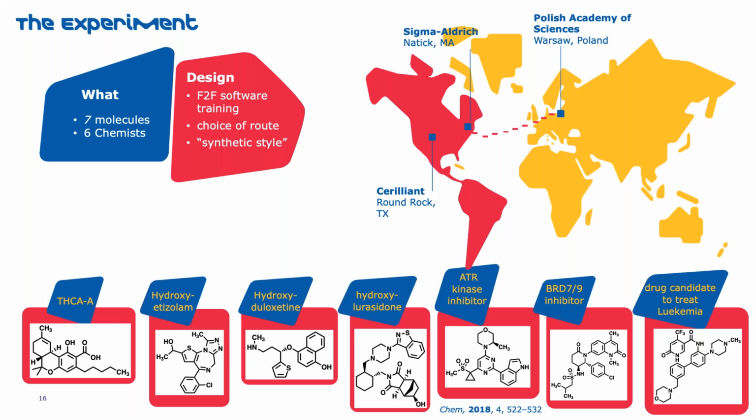And these were molecules that were of high financial interest to us, so real projects we were working on, either existing products that we wanted to optimize the routes for because they suffered from low yield or high cost, or new targets that we wanted to access. And it was really important to have those chemists who were working on the projects be able to use the software themselves to design the routes so that they could customize it based on their needs or their limitations in their lab.